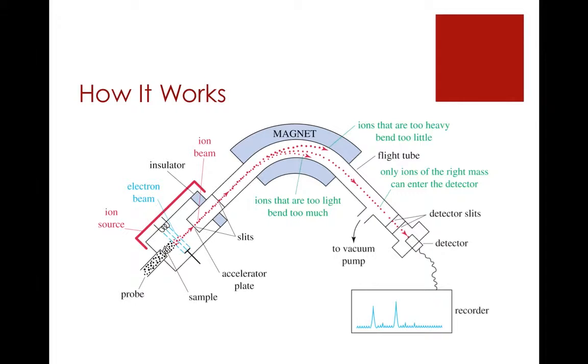There are multiple types of mass spectrometers, but they usually work in a general way. The mass spectrometer is in constant vacuum to remove any air particles. Once the sample is inserted, it is hit with a beam of electrons in the ion source, breaking the sample into ions. The ions are then accelerated through the mass analyzer by a calibrated electrical field and magnetic field.